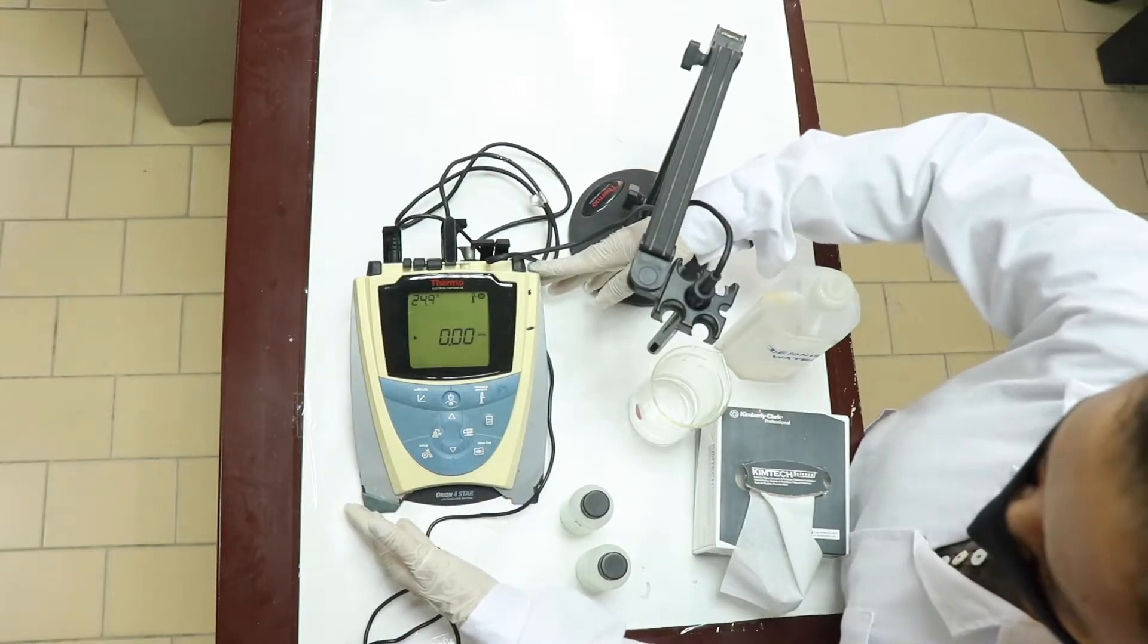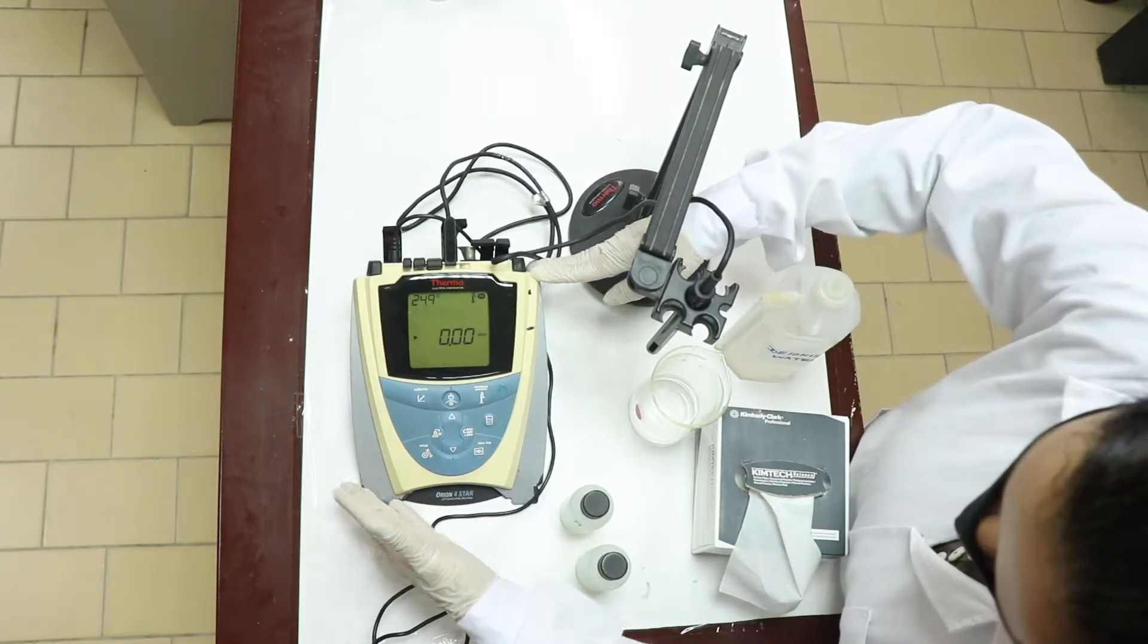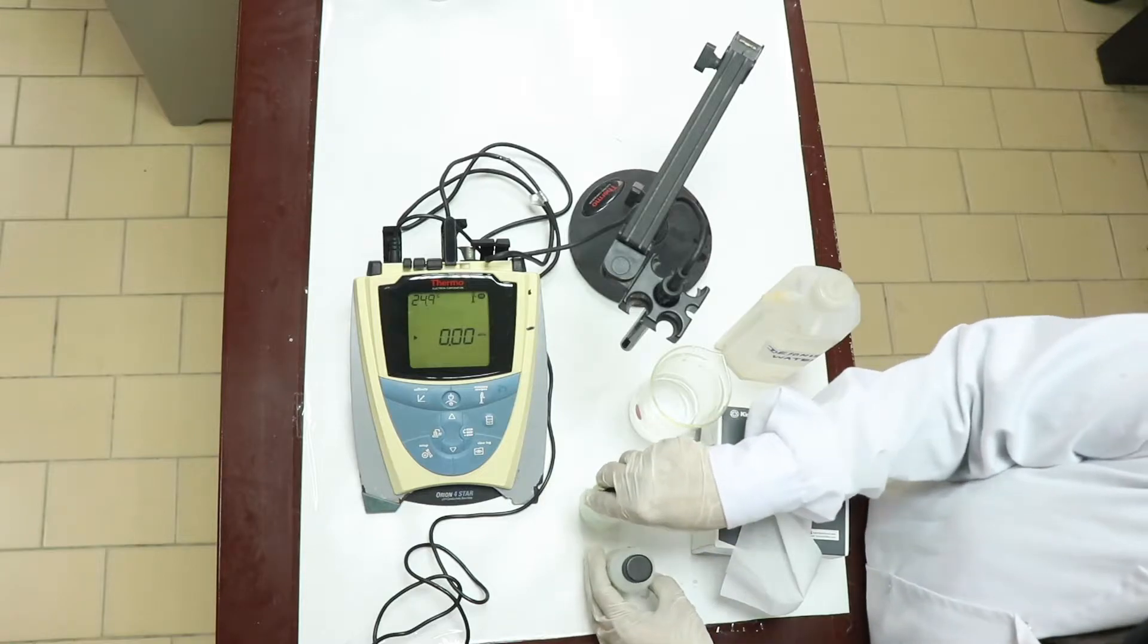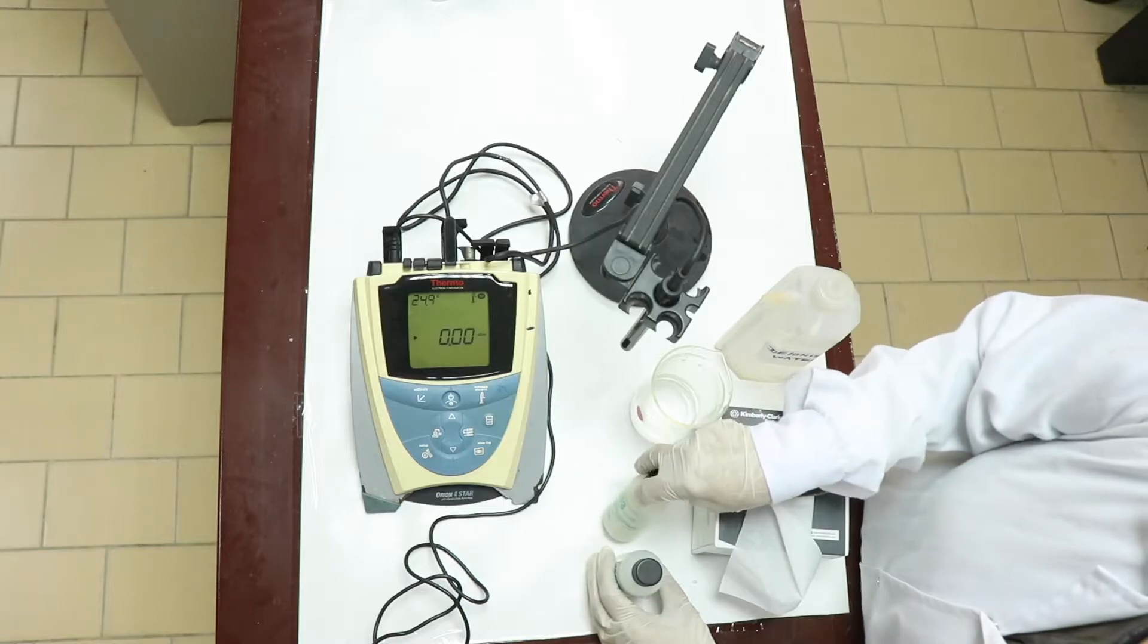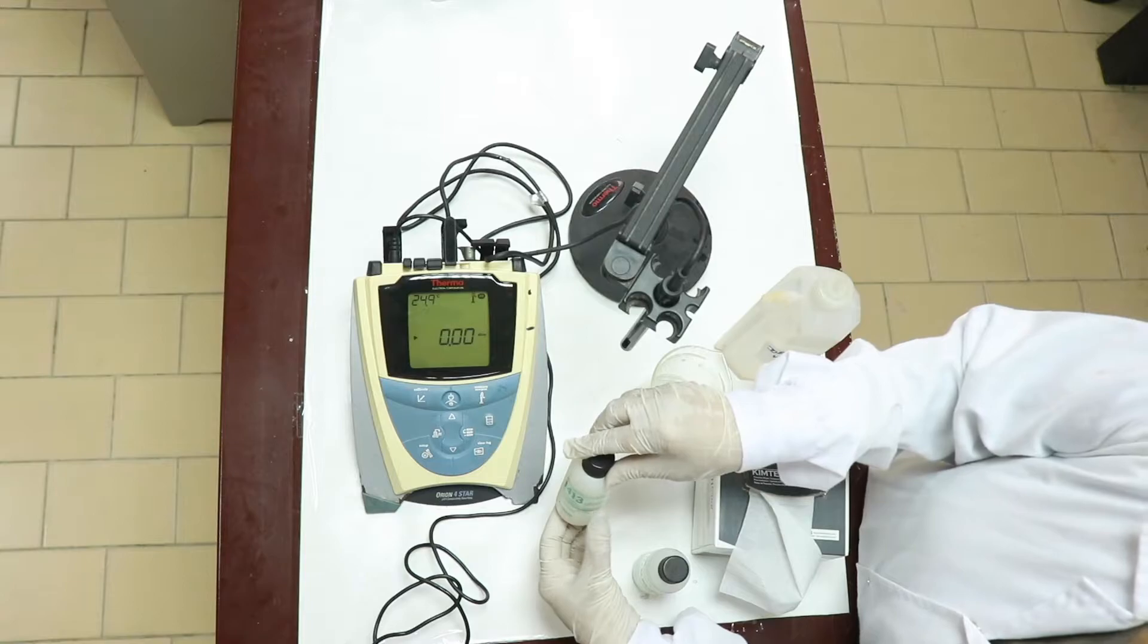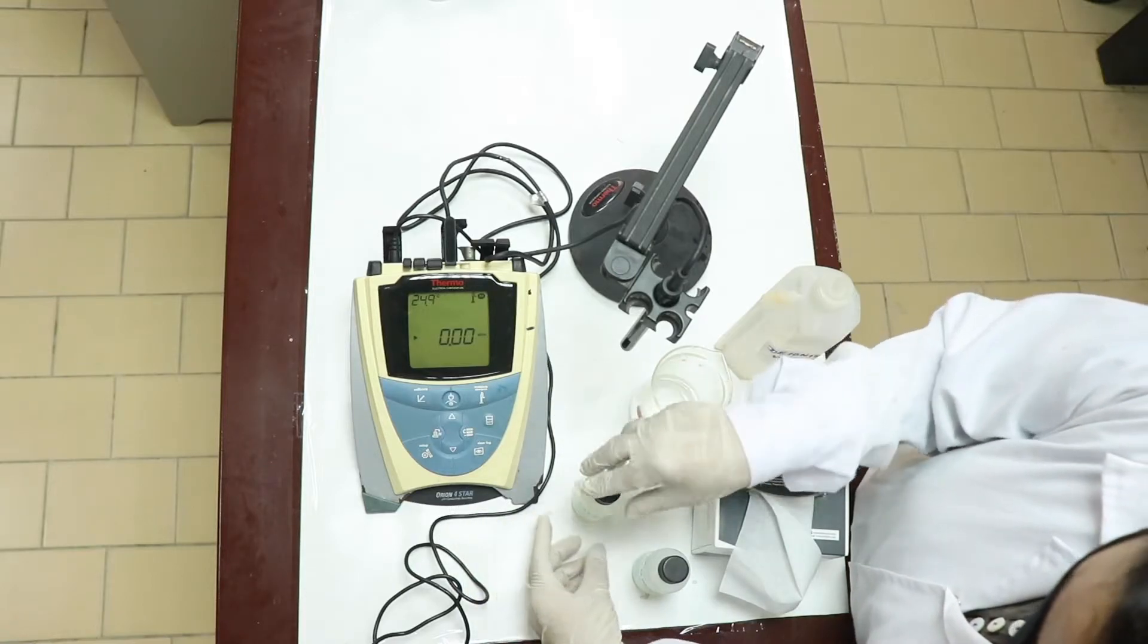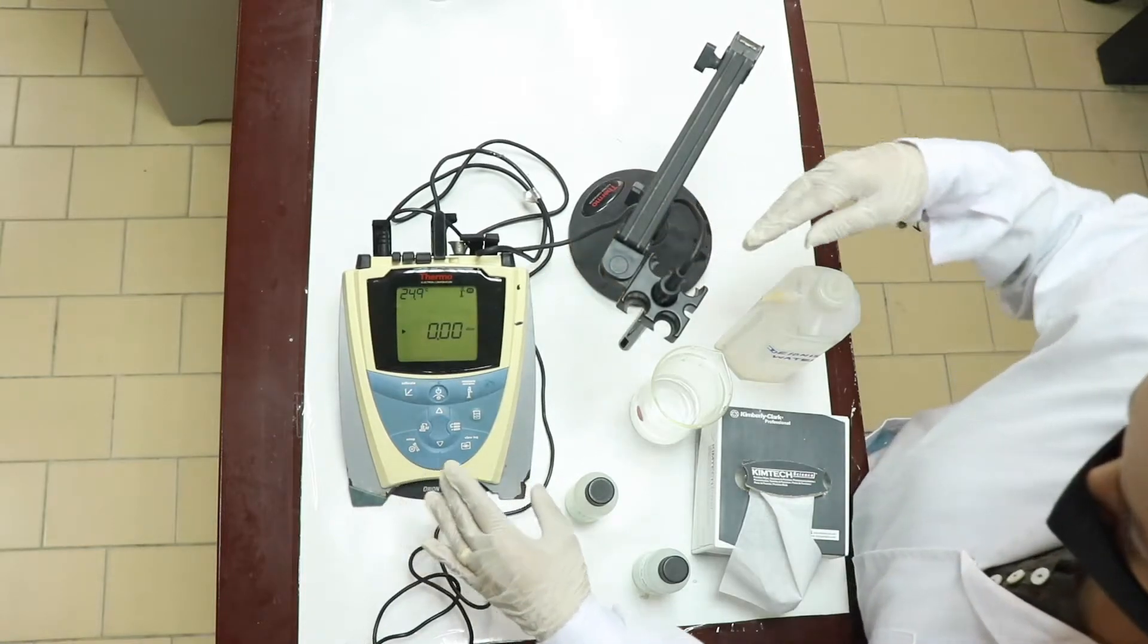First we have to calibrate this machine. We are going to check whether this machine is able to read the conductivity of the solutions which we already know. By this we are able to cross check whether the machine is able to read the values correctly or not. First let us use the small value 1413 microcms per centimeter. This is the conductivity of the solution which is given. I am going to check whether this machine is able to read this. That process or step is called as calibration.